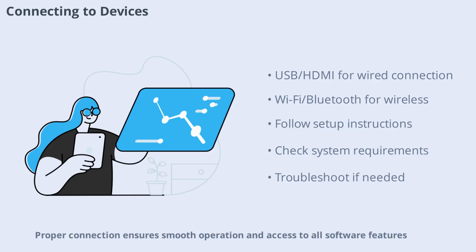Proper connection ensures smooth operation and access to all software features. If you encounter issues, check cables and drivers, or consult the user manual for troubleshooting tips.